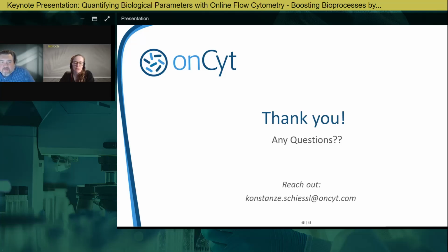I think one hot topic right now is perfusion, where you really run a more continuous bioprocess. And there, for example, shear stress might be interesting. That's something you can quantify with a flow cytometer, and it will help you make sure that your stirring is good enough to get oxygen in, but not so high that you would stress your cells. So this is something that could be used to monitor the process. Others might be cell cycle, or apoptosis.